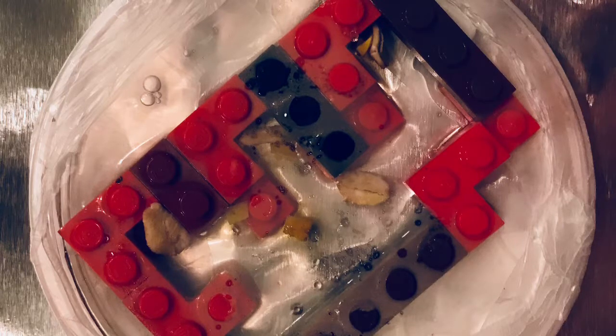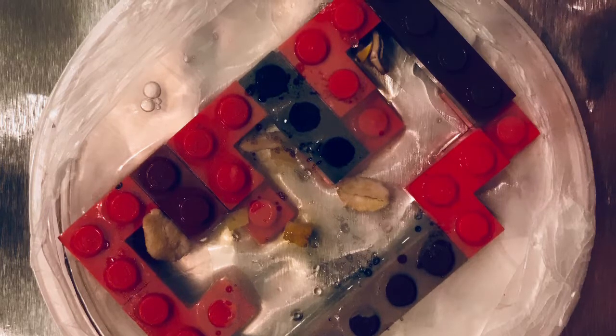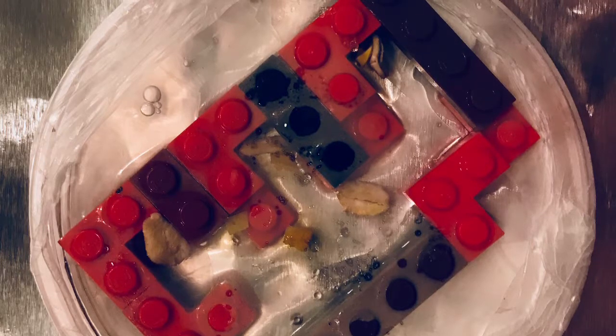As you can see in this picture, one error which we did not account for was the movement and separation of certain cultures from an oat. This prevented the cultures in the middle and bottom left of this picture from having an immediate food source.